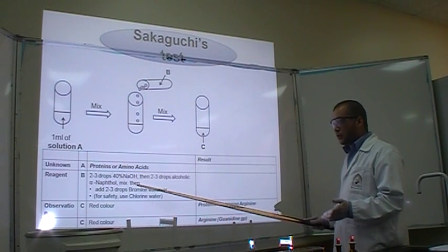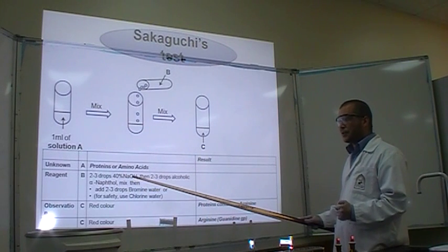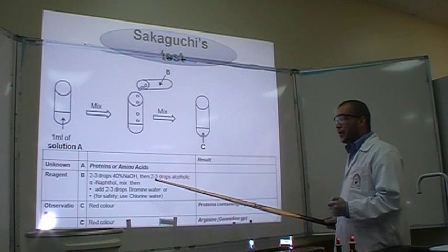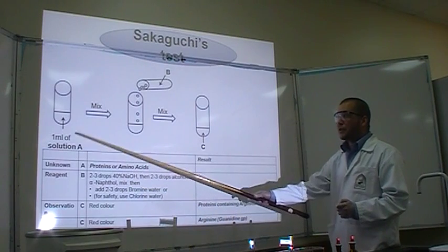Add 2-3 drops of Sakaguchi reagent, which is 40% sodium hydroxide, and mix well.